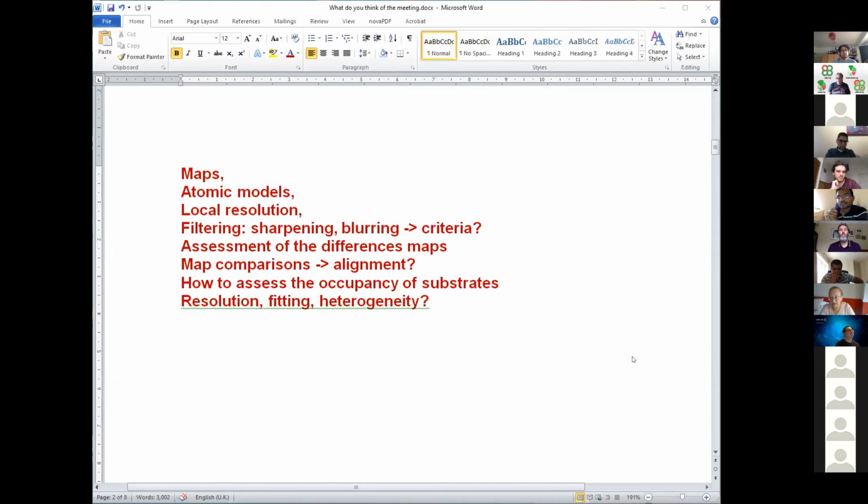And in Relion, for example, you have to give a temperature factor or B factor, and what should you do? 40, 400, 80, and so on. And then people suddenly see imaginary fine details, but they're not realistic because they're just enhancing high frequency noise.